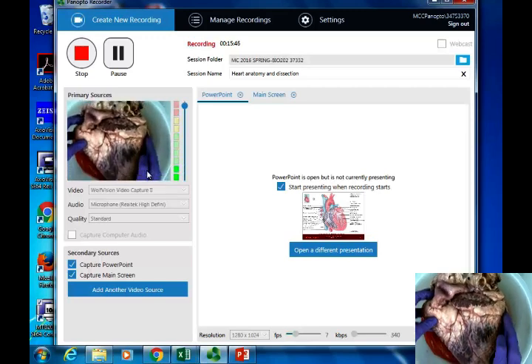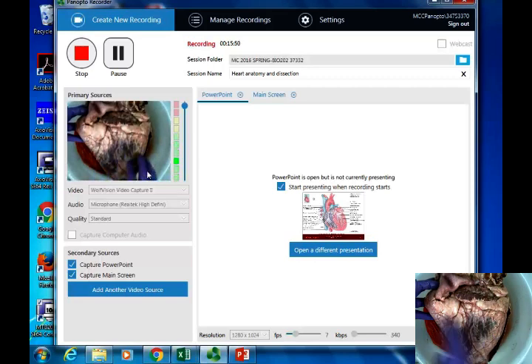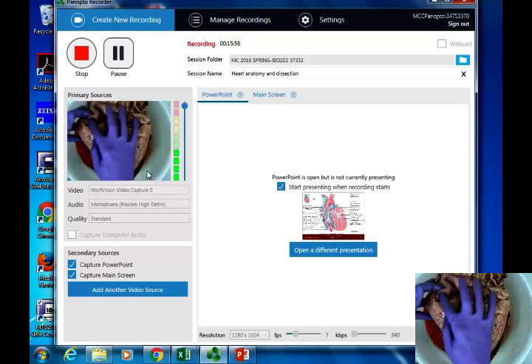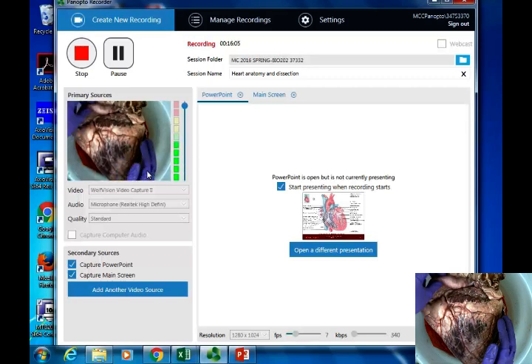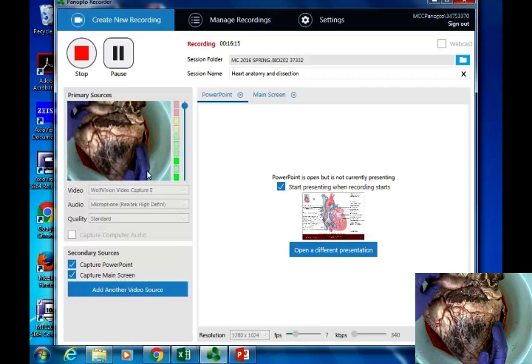All right, so same type of thing. You can see, at least a little bit, it's got the same type of organization to it. We can see that V-shaped pattern to it, apex down there, base up here. You can see an auricle up here, the ear-like flap. We can definitely see some blood vessels, but look how much more pliable it is, okay? While it's a little bit gross because it's squishy, it's more true to what the actual structure needs to be. We need these things to be able to expand like a balloon to accommodate blood when they're filling, and then go through an elastic recoil when they're emptying, okay?